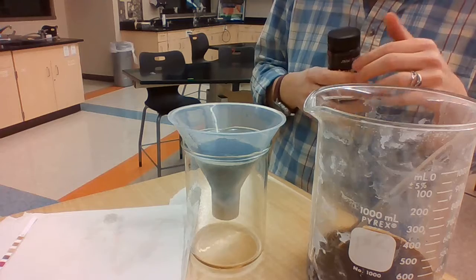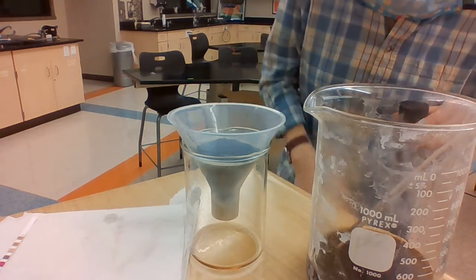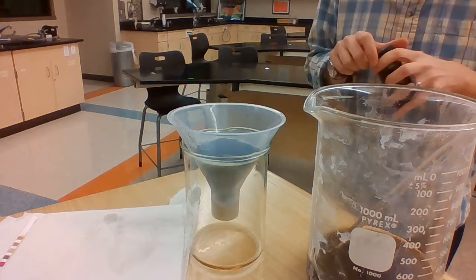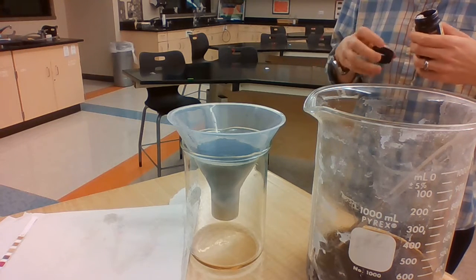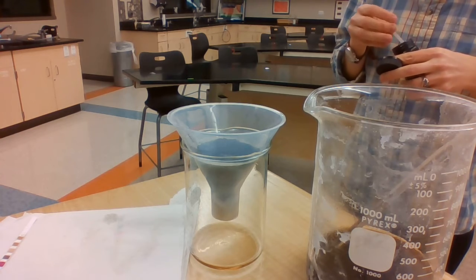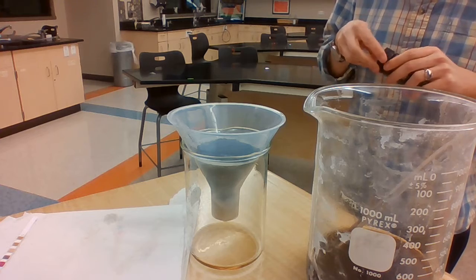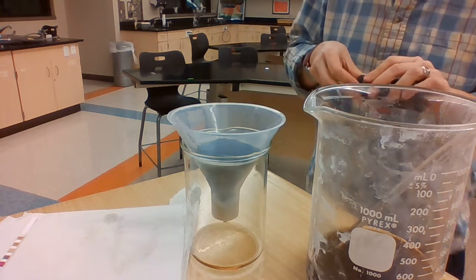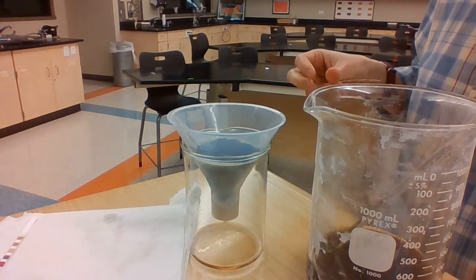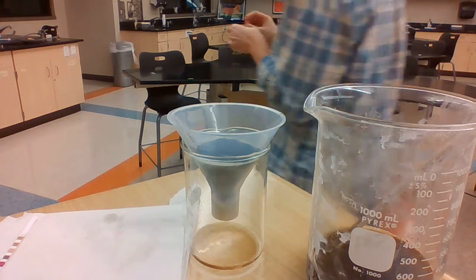As soon as I have enough dripping in here to do another test strip, we're going to test the filtered water and see what the water quality is of the filtered water. We're also going to have to describe that filtered water, so just hang tight. I'm going to go grab a beaker to put my filter in, and then I'm going to show you what that filtered water looks like up close so you can get a better view.